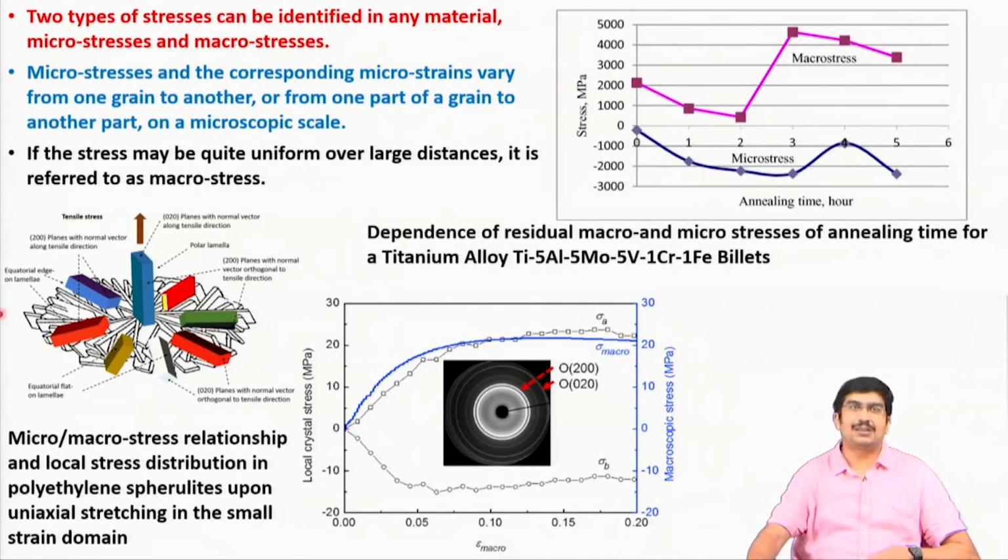So, if you think of this to be a complete grain, and this grain now has different regions with different orientations, different dislocation subcells, you can imagine the macroscopic stress is applied on all of these smaller grains, and microscopically these individual grains have a different amount of microstress. So, ultimately what you can imagine is that the macro stress and micro stress do not correspond one to one.